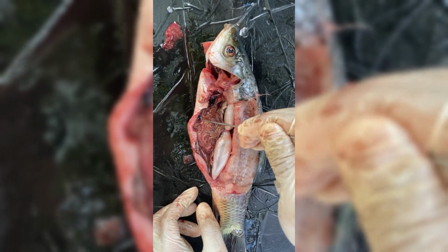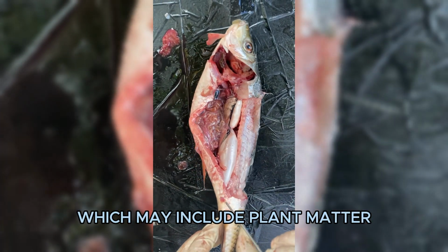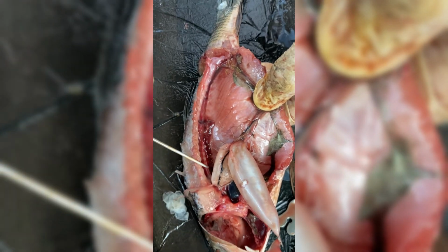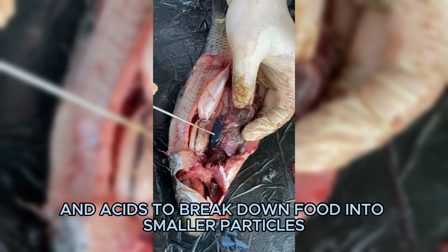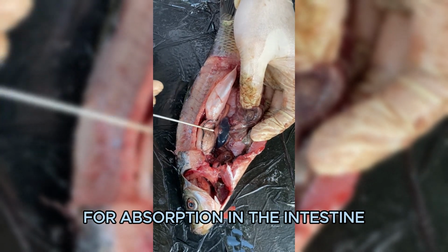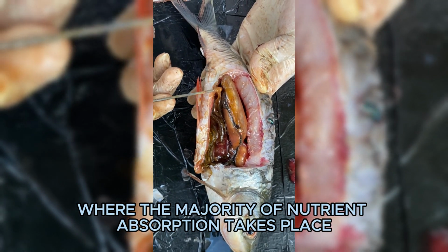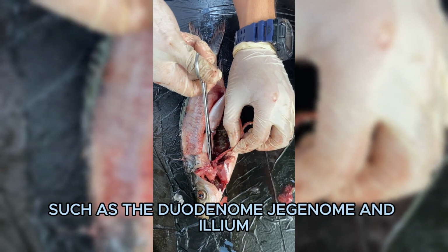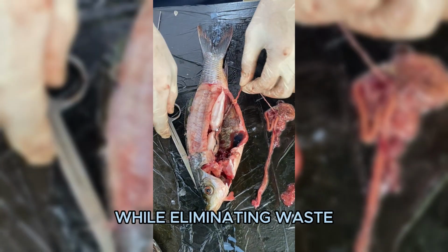Carp stomachs are adapted to handle a diverse diet, which may include plant matter, insects, small crustaceans, and other small organisms. The stomach typically secretes digestive enzymes and acids to break down food into smaller particles for absorption in the intestine. The intestine is where the majority of nutrient absorption takes place. It follows the stomach and it is divided into sections such as the duodenum, jejunum, and ileum. It absorbs nutrients, water, and electrolytes from food while eliminating waste.